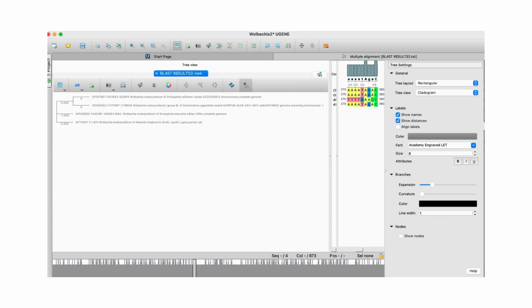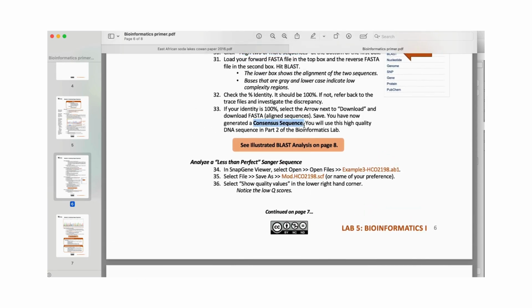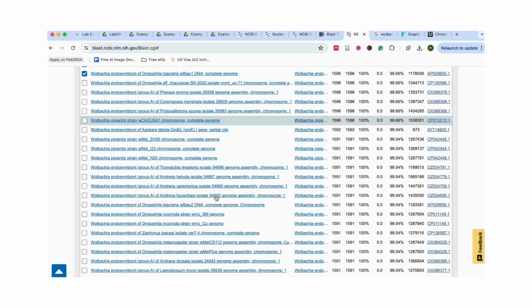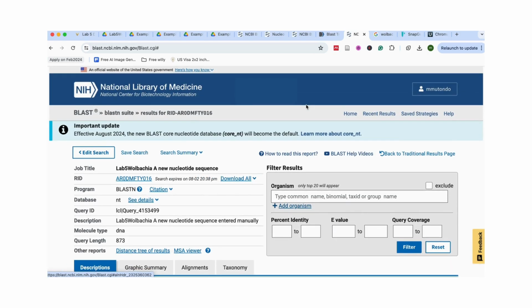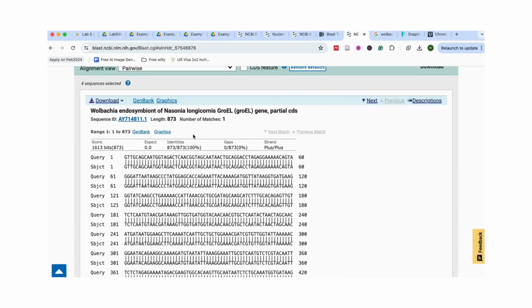So if we go to the exercise, we were looking over here. This is this consensus sequence, I think, just before we zoomed on. Sorry to take you back. The consensus sequence was what we generated. Remember when we were saying the consensus between the different sequences that we looked at. So when we looked at the hits that we got from the BLAST, we got the two which were close to each other. So this would be your consensus sequence right here.